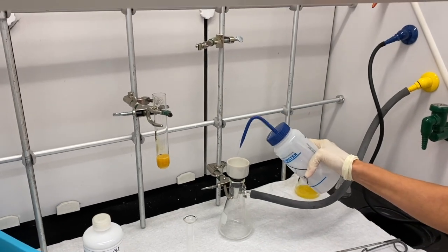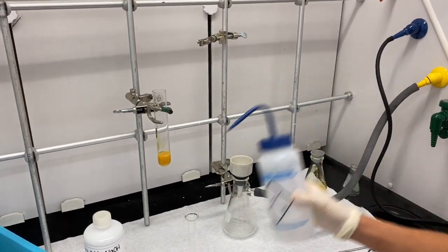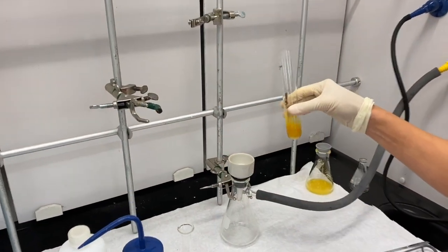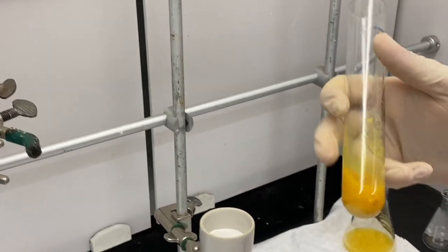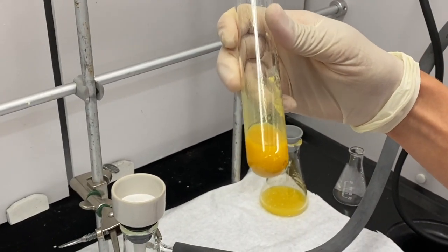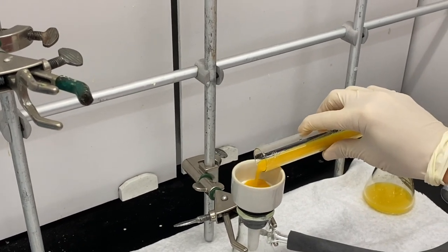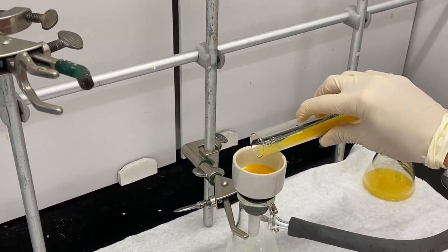Now we're going to filter our resulting reduced product, which is going to be luminol. You can see we've got a solid in our solution — that solid is what we hope to collect. I've wetted my filter paper.